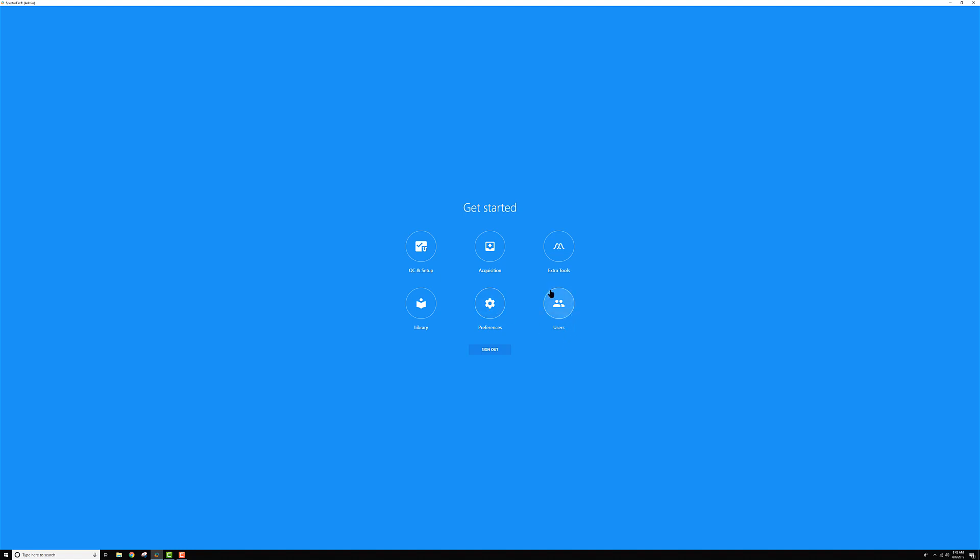Last but not least, there's the users section. This is where you would go to reset passwords, change passwords, add users, maybe change the user status from admin to operator or vice versa, and also you can look at the use time of users in this section.